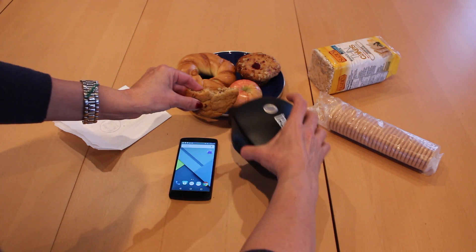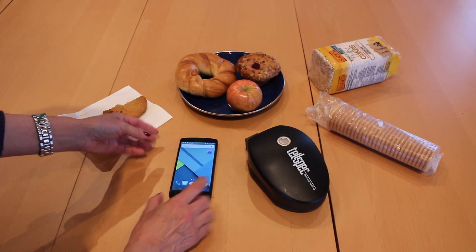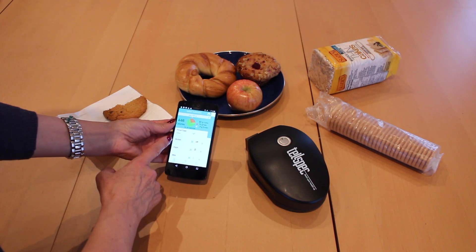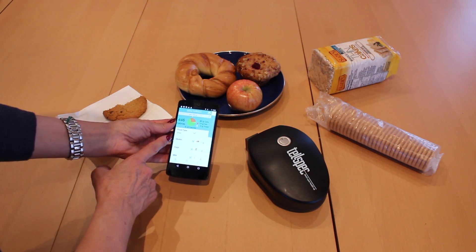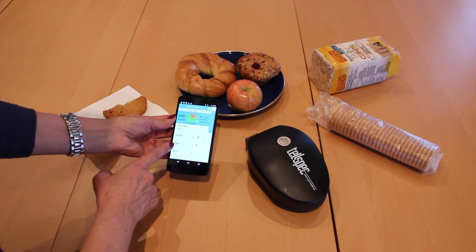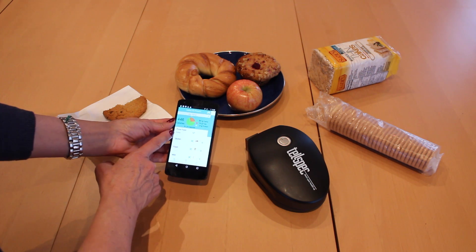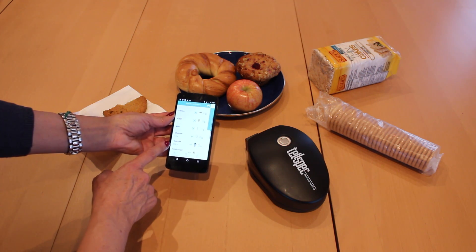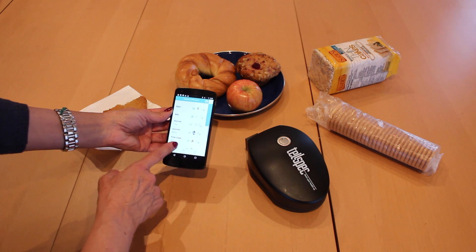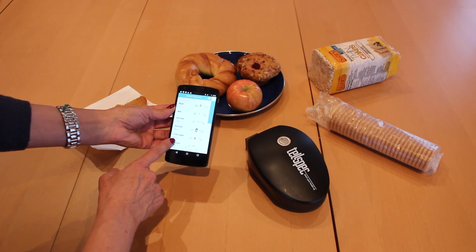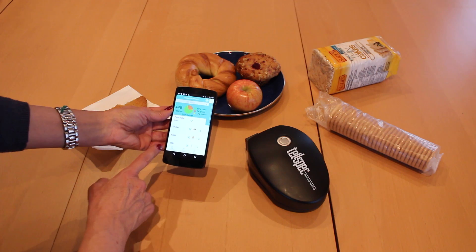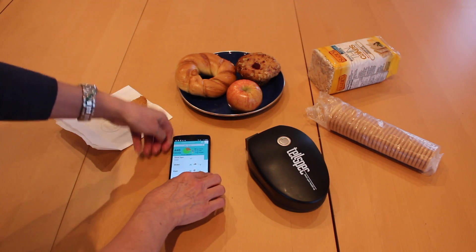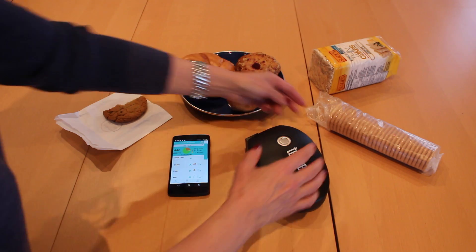Here it is — gluten: no, eggs: no, milk: no. It's high in glucose and sucrose; in fact it's very high in sugars. There are 64 grams per hundred in sugar, so it's mostly sugar.